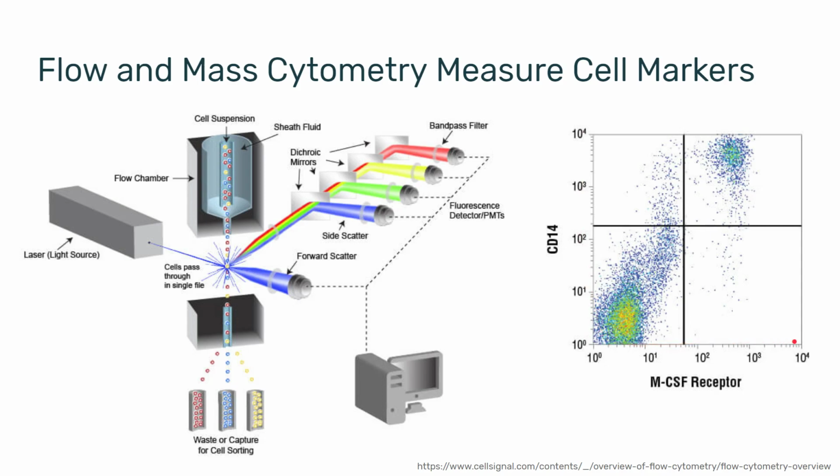Now it's really important to remember that we're measuring through several layers of proxies. The values we see here are the intensity of the light that we measure. The intensity of the light corresponds to the abundance of the antibody, and the antibody binds to the marker. So there's always noise around these measurements. However, they are good enough to be able to say certain things.